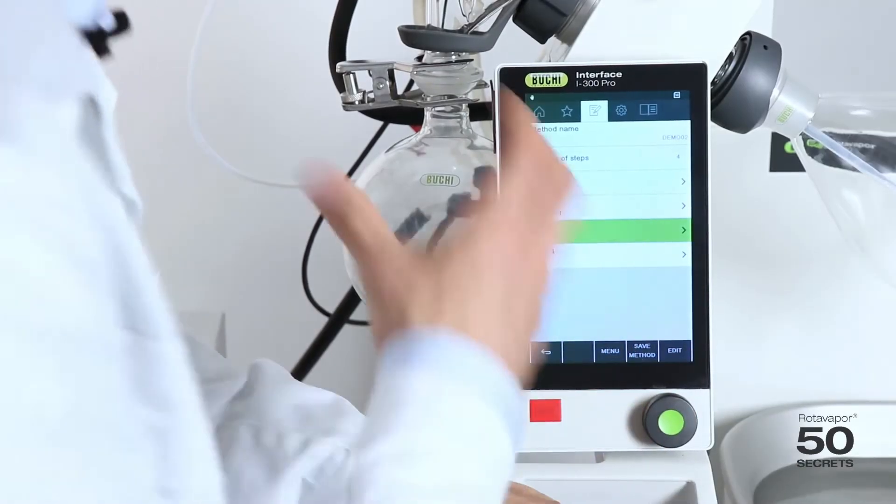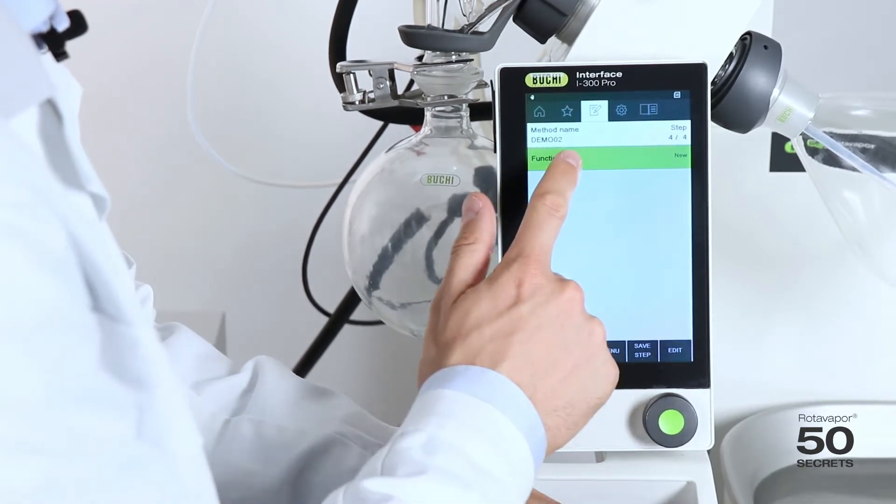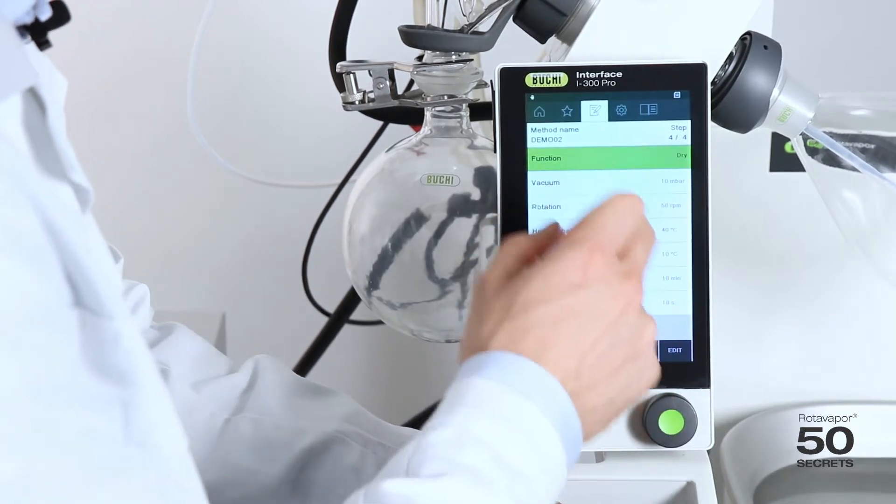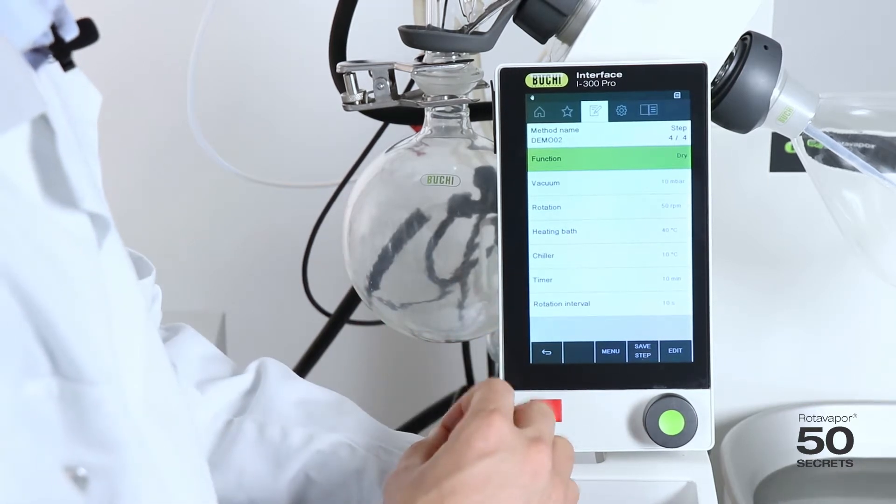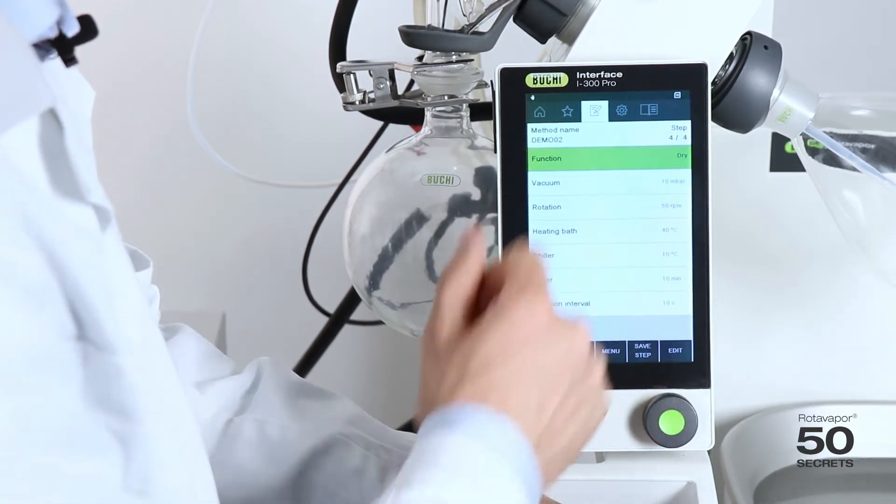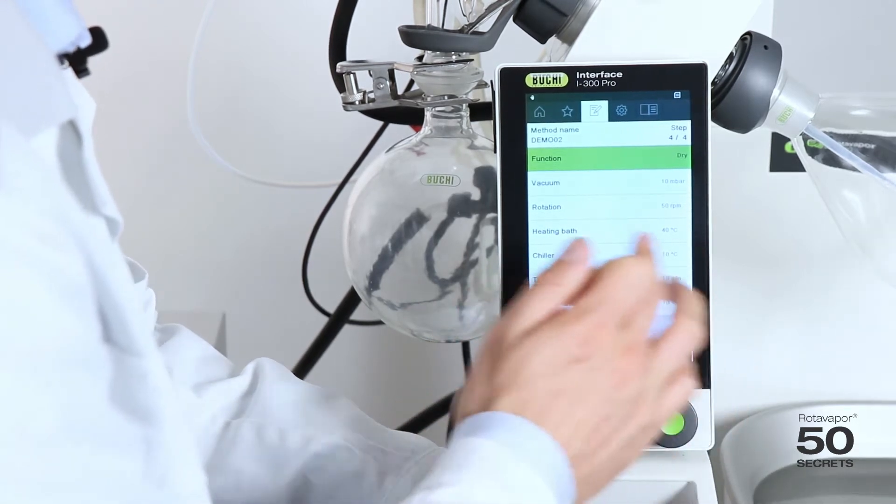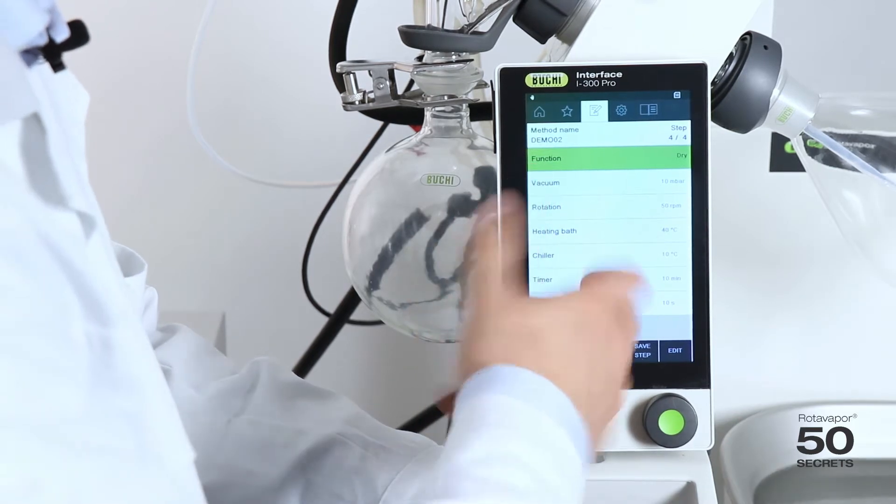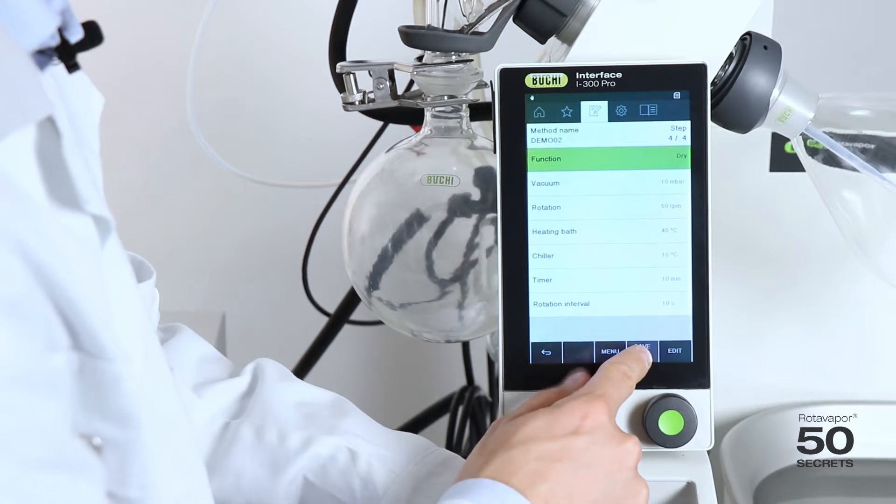And now we want to dry the sample. That's the last step. We go in. We select the function dry. Let's say 10 millibars is okay. We could even go lower just so that the pump is running full speed. Rotation 50 RPM seems fine. 40 degrees heating bath. And we want to do this for 10 minutes. And the rotation interval 10 seconds into one direction. 10 seconds into the other direction. Let's save that.